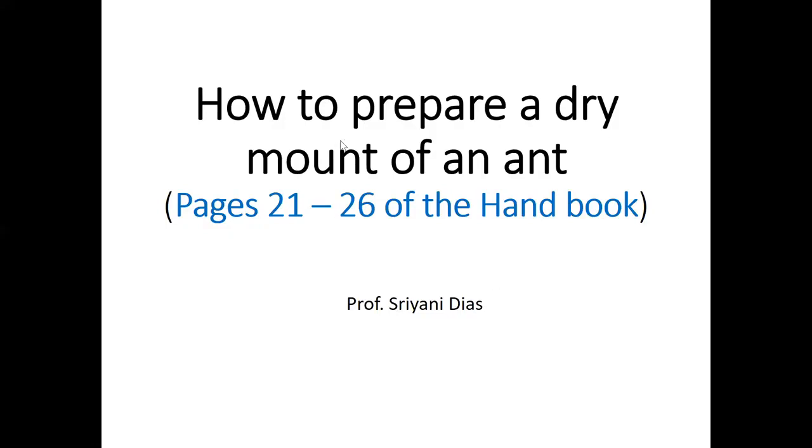Now, okay, assume that you have ants preserved in ethanol. Then for these classification studies or taxonomic studies, you need to prepare a dry mount of an ant. I mentioned earlier in one of my lectures that there is the handbook prepared for the training workshop, which is uploaded to the website. So this is the information on pages 21 to 26 of the handbook.